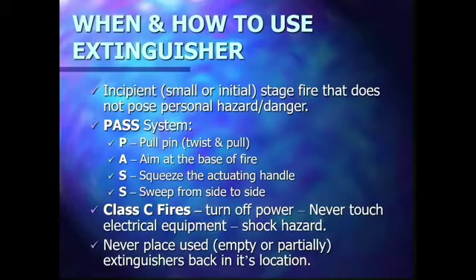It's very interesting to note about electrical fire. With a Class C fire, make sure you have the electrical supply cut off. Then we address the fire.